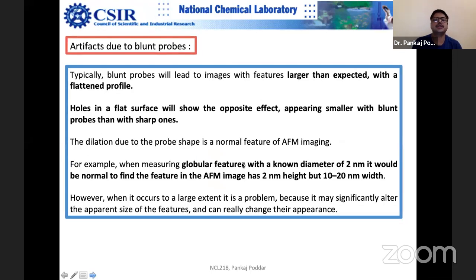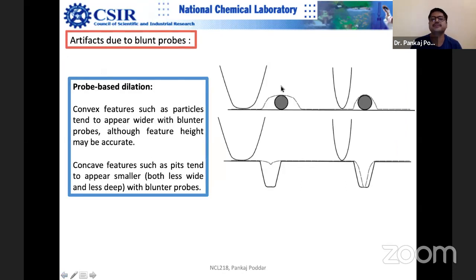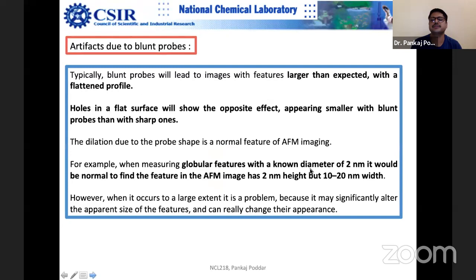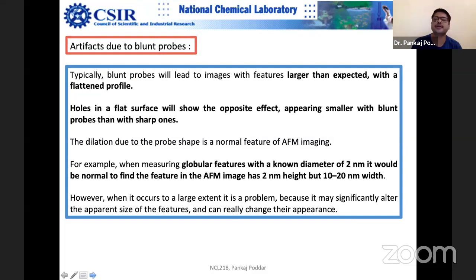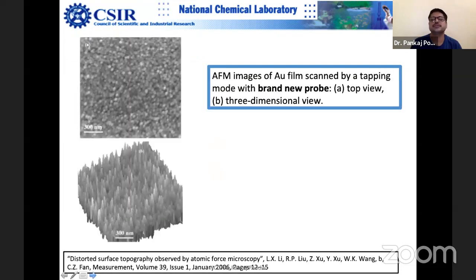It is normal to find a feature in an AFM image with a 2-nanometer height but 10 to 20 nanometer width. So we have to decouple horizontal and vertical resolutions. This is from a brand-new probe — top view — scanning a gold film in tapping mode. This conical probe either is dirty or has gone blunt. You can see something is sticking or there is a flat region on the tip.